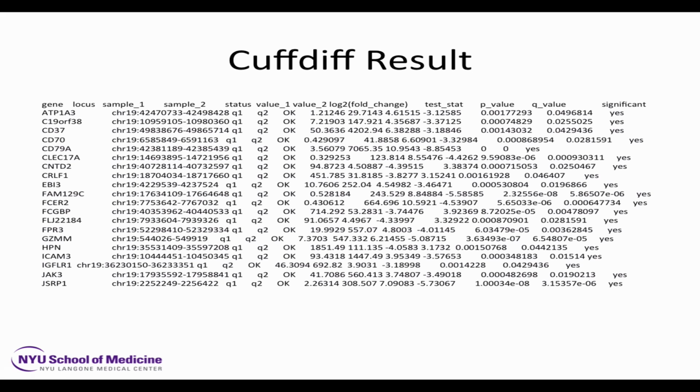And this would be your result. I also put the result in a folder called diff in that same RNA-Seq tutorials 2016, ifs data tutorials RNA-Seq 2016 diff has this output file, so you can see the format of what you're going to get.